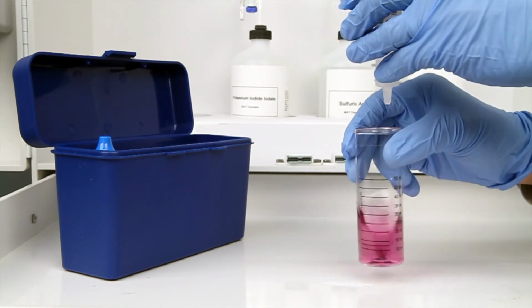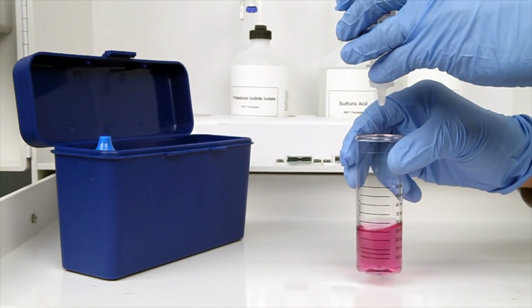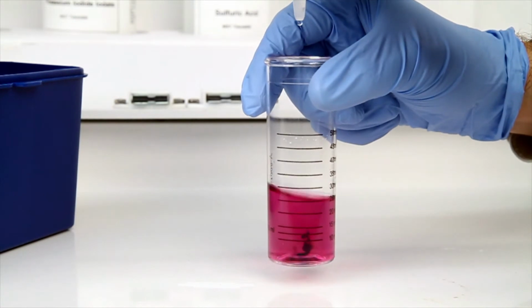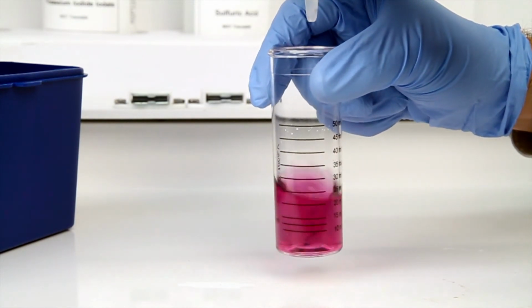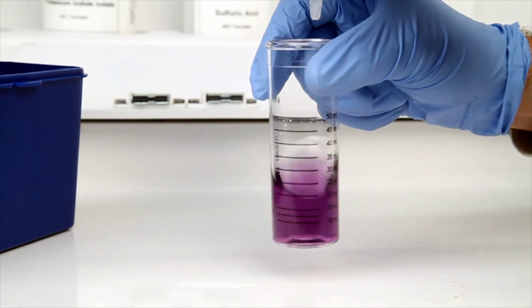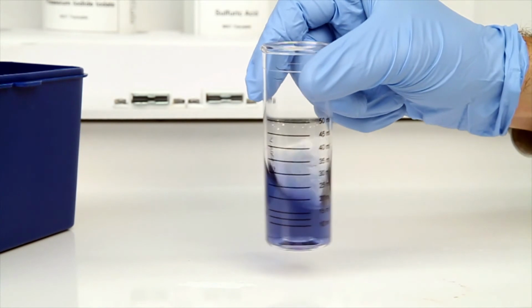The bottle of titrant contains a dropper tip, therefore it's important to hold the bottle vertically to make sure you get a consistent drop size. After the addition of each drop of titrant, you want to swirl the vial to make sure the sample is properly mixed. According to the endpoint ID procedure, the titration is complete when the sample is changed from red to blue.